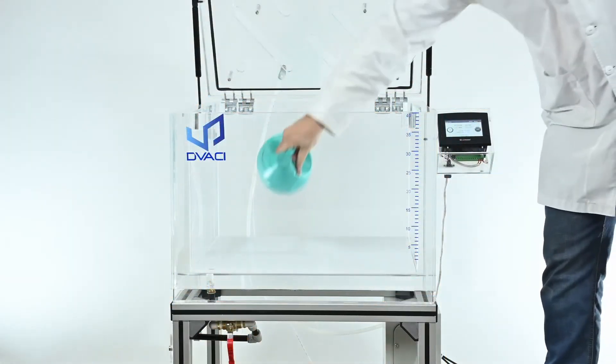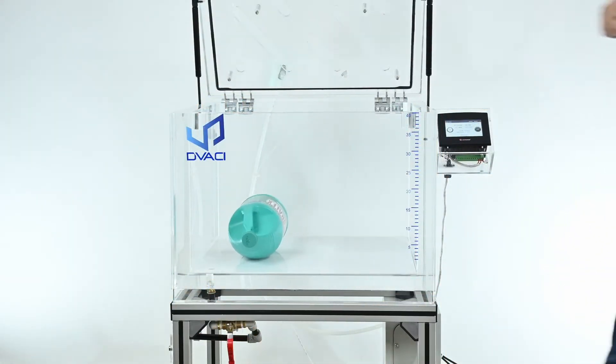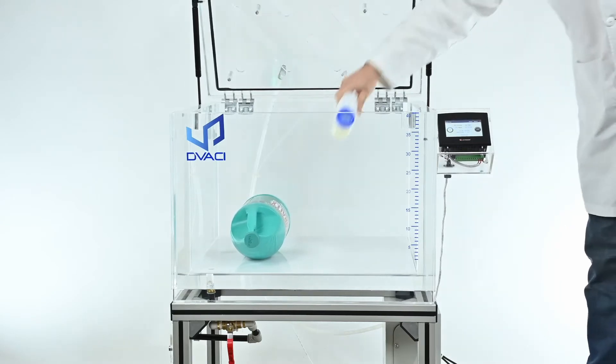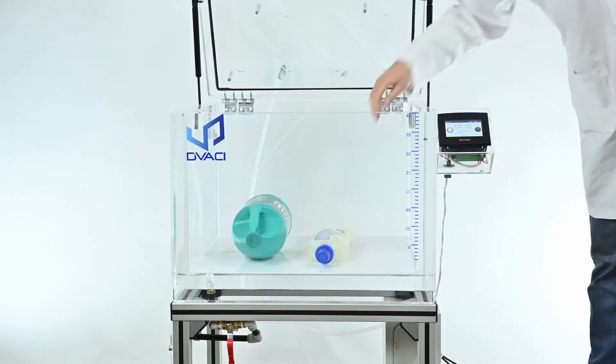Our vacuum chambers are ergonomically designed with intuitive operation as well as easy maintenance and calibration.